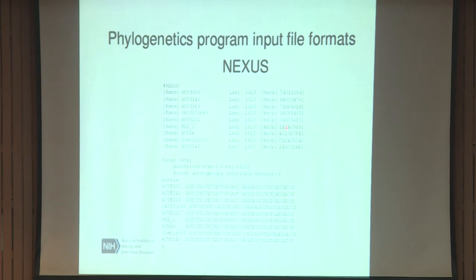This is the Nexus format. It is a little bit complicated format because you have to type it in the DOS and then create this kind of format. But today there is no need because there are different softwares available. If you have a FASTA format, the software can convert those into different file formats.